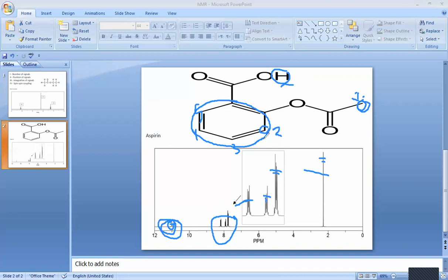And the other thing is that since we have almost three groups, that's why I said there must be something missing here, because we have one group of hydrogen here. This is the second group. And I think this is the 3rd and 4th group, or only the 3rd group there. So this tells you why we have this number of signals.